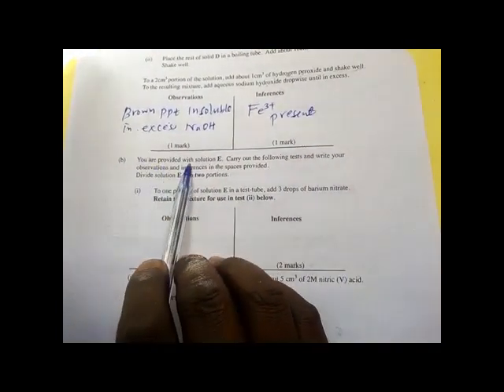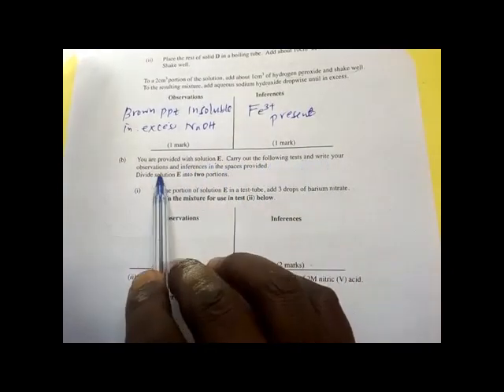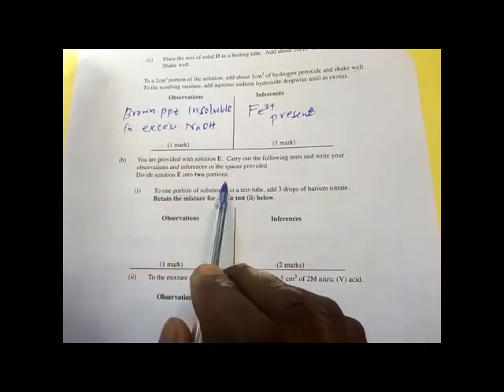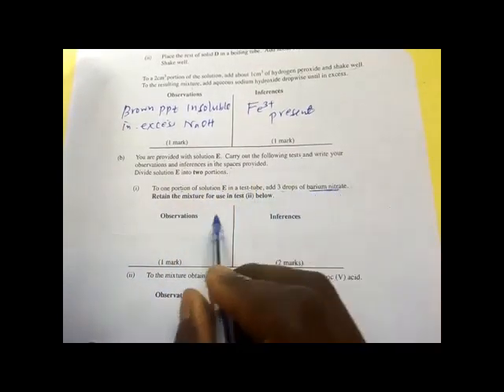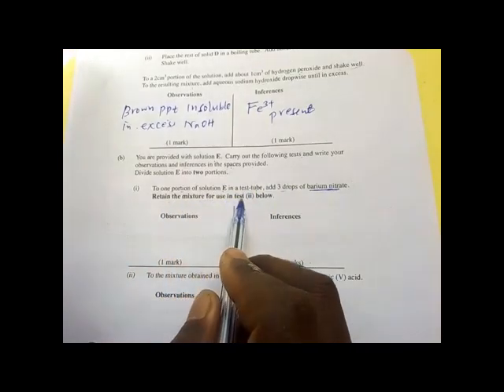You are provided with solution E. Carry out the following test and write your observations and inferences in the spaces provided. Divide solution E into 2. To one portion of solution E in a test tube, add 3 drops of barium nitrate. Retain the mixture for use in test 2.